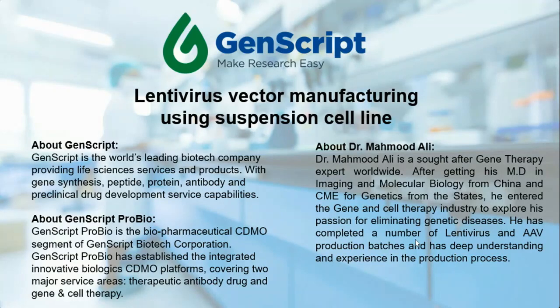So in this webinar today, we are going to discuss lentivirus vector manufacturing using suspension cell line.